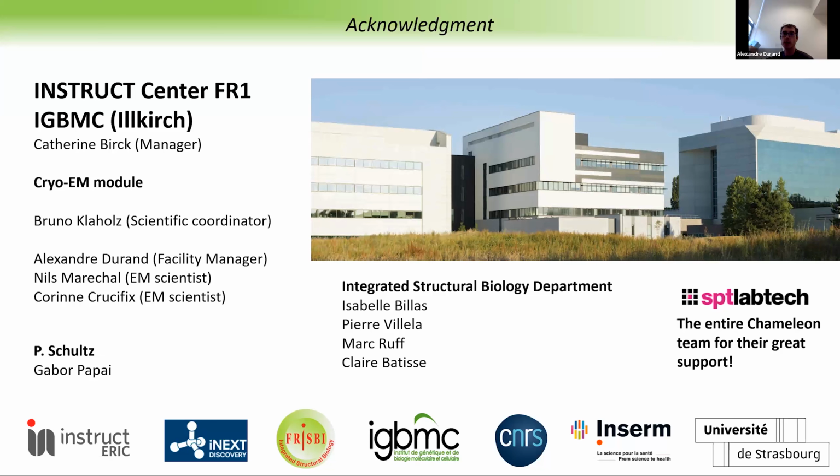And also because, generally speaking, it's easier to perform the Vitrobot experiments, and the user is independent to do that, so it's more integrated into the workflow. Also, you have less possible data collection area on the grid because you spray a single band, so it might be tricky to find enough regions for data acquisition. So this is not something I will use as a first attempt when running a new project.